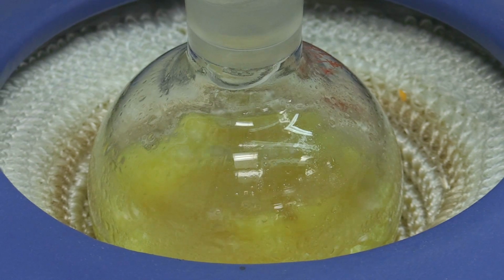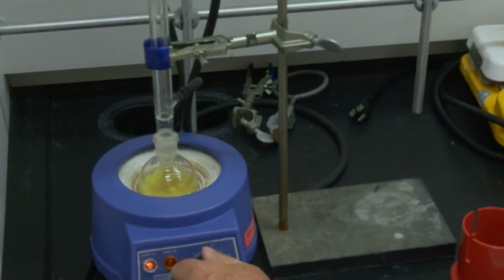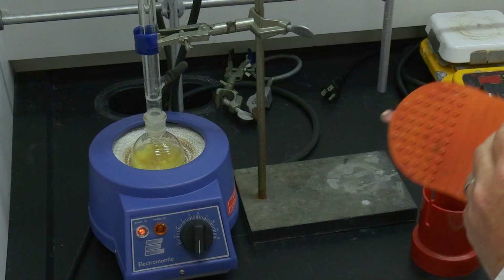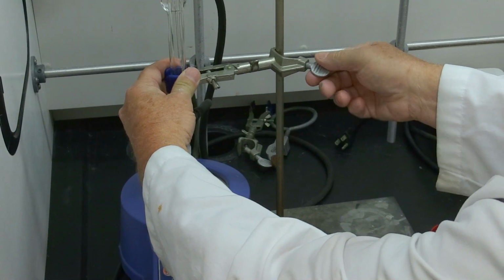So the 90-minute reaction time has completed for part A. So we're going to remove the vessel from the heat, since we don't need the heat anymore, and that comes off nice.